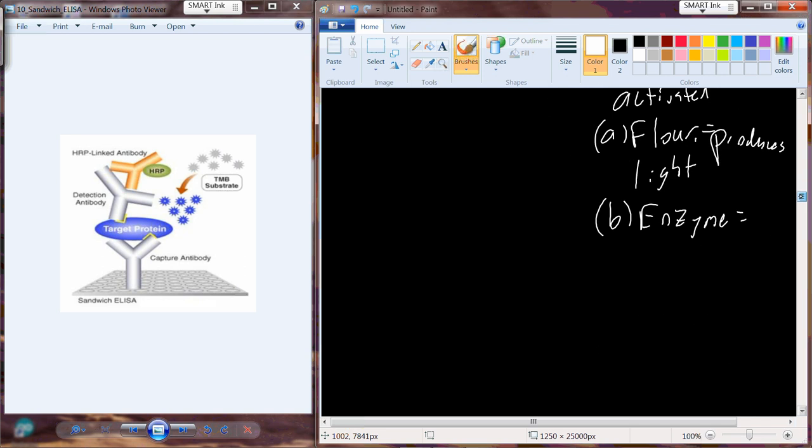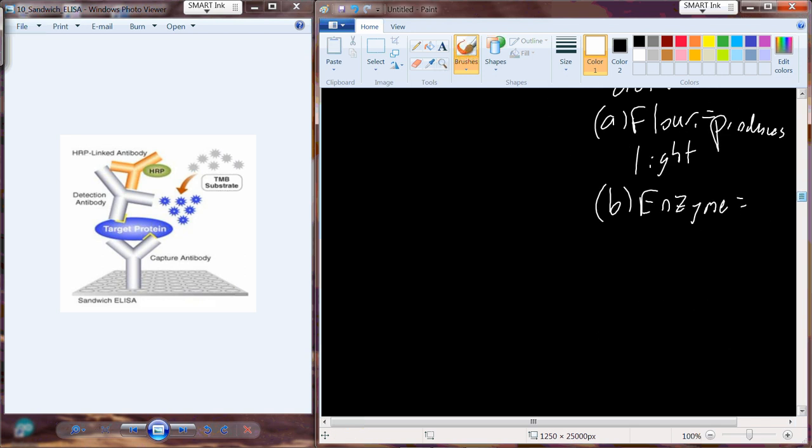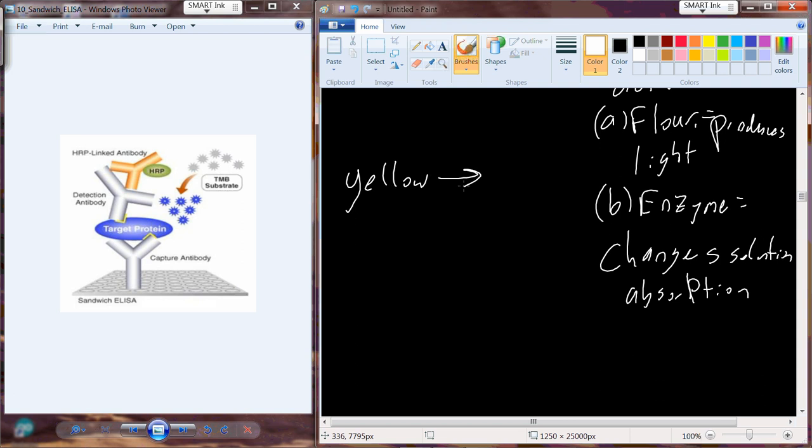In the case of an enzyme, we would provide a substrate, and that chemical reaction would occur. Substrate would be converted to product, and as that product is accumulated in the well, it does something to the solution that's inside of the well. So we'll a lot of times have a colorimetric change, right? We'll start out and we'll be yellow, and then we put the substrate in there, and if we have high amounts of substrate, which means we have high amounts of our protein of interest, it shifts the color to blue, and then we can use a detection device to measure how blue the well became. And the bluer it became, the more enzyme was present.